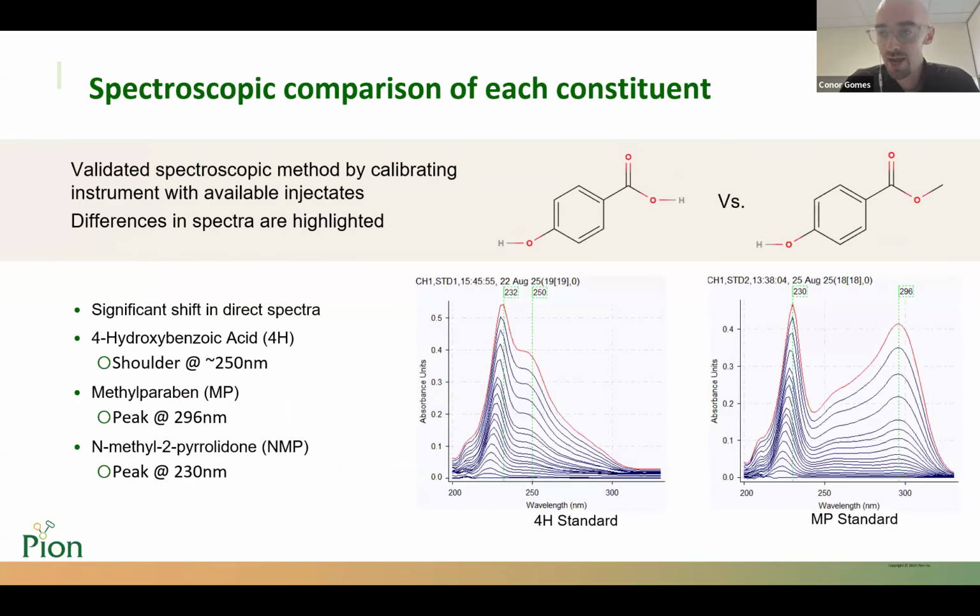So in order to track the release of these drugs, we employed that rainbow system I spoke of with the in situ fiber optic probe within our acceptor chamber. The solvent used to solubilize all these molecules was NMP, N-methyl-2-pyrrolidone, and the peak of the NMP is this one at 232.